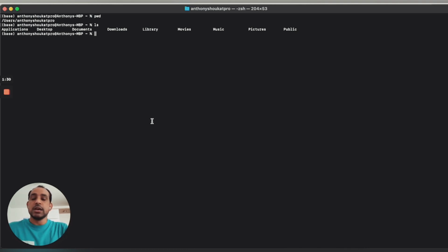So next thing is, if we want to go to any specific directory, what we need to use. So for changing directory, you can use cd, changing directory. You can use it for going up and down. For example, if you want to go to another level like documents, you can use this. If you want to come back, you can use cd plus two dots.